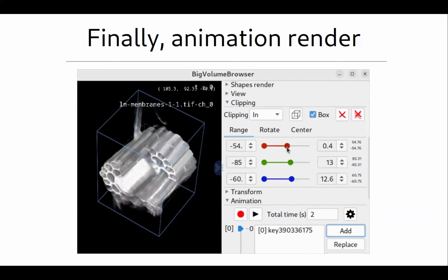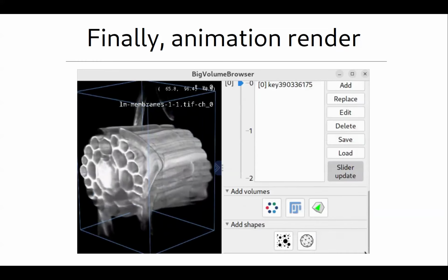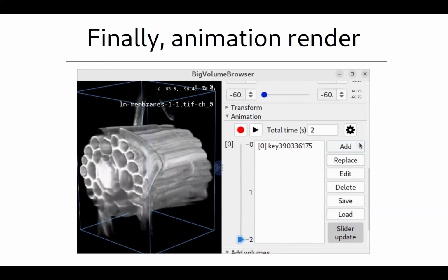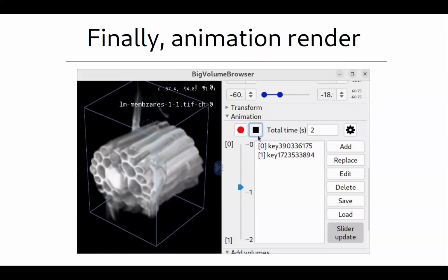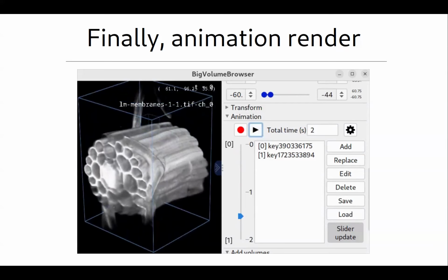So here I added this camera orientation and these clipping settings, right? Now I'm changing the clipping settings, and I move the object. Now I'm going to the panel, and I say, okay, after 2 seconds, I want the thing to look like this. I can click preview, and it right away morphs one thing to another. So this is the way to make movies, right? I don't know if you ever worked with any other packages, but it's very similar to the others. Apart from 3D Script, where you need to type things, which is also pretty nice, but this is the approach selected here.